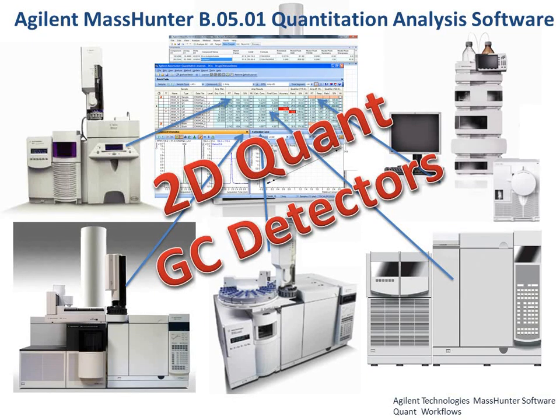Greetings. I'd like to discuss the use of 2D quant. In other words, you don't have a mass spec as shown in this picture here. You're just going to run with a 2D signal as opposed to a 3D signal. That would be, in the examples here, a GC detector, like a FID with the universality of it, or an ECD, appreciating the sensitivity of that.